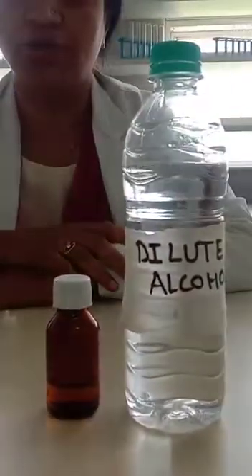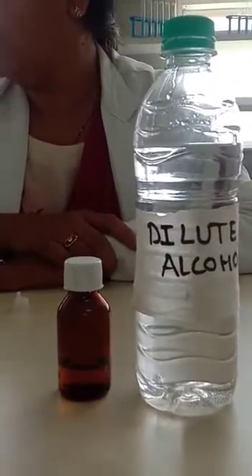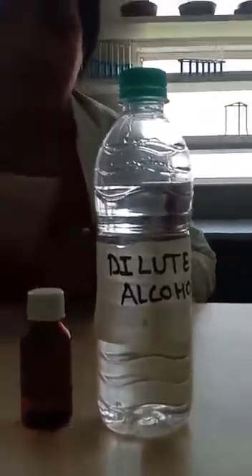This is how the dilute alcohol is prepared. Uses of dilute alcohol: it is used for preparation of potencies and cleansing of instruments. This completes the preparation of dilute alcohol. Thank you.